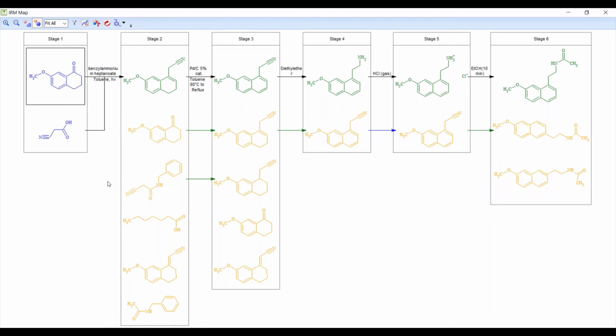Now, again, this is all customizable to the user, and if you had specific needs, such as putting a specified impurity color or genotoxic impurity color, you can do that as well. What's nice here is this is still dynamic. And what I mean by that is that what the software will do for an impurity mapping, especially for a process chemist, since this is still live, I can actually show the whole impurity fate.